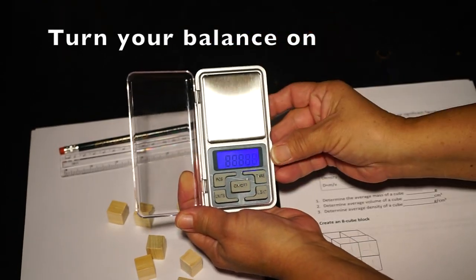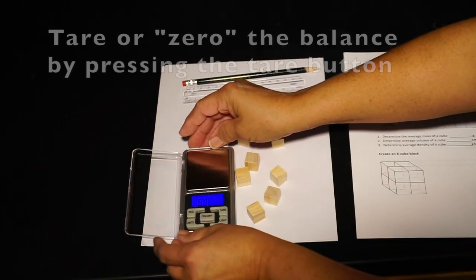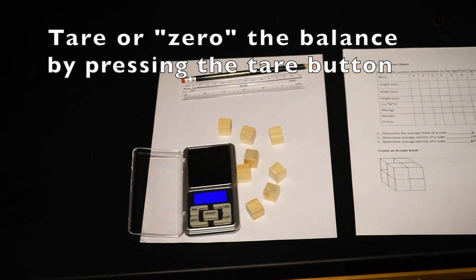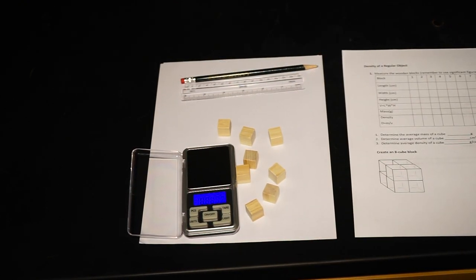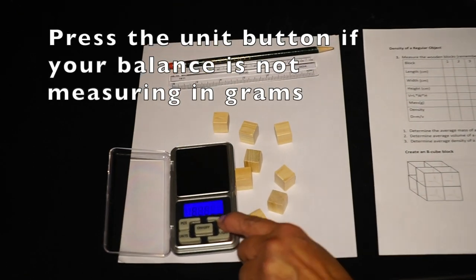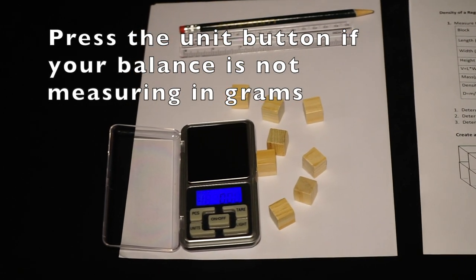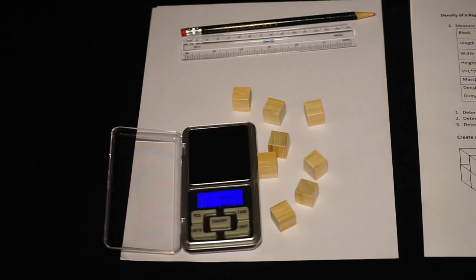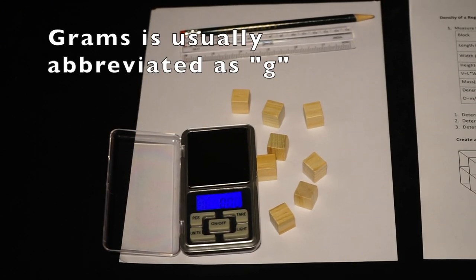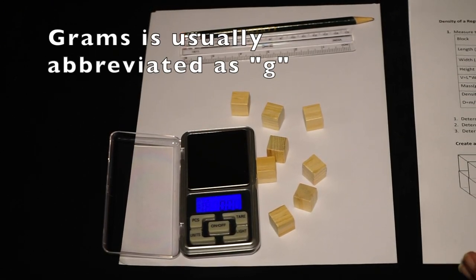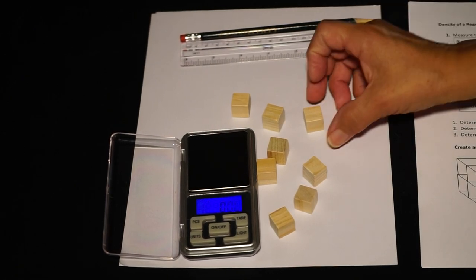Density of a regular object: First turn your balance on by pressing the power button once you have placed it on a flat level surface. Press the tare button to zero the balance. This tells the balance you're starting with nothing. Be sure the balance is in the unit of grams. If it is not, press the unit button until grams is displayed, usually abbreviated as G.